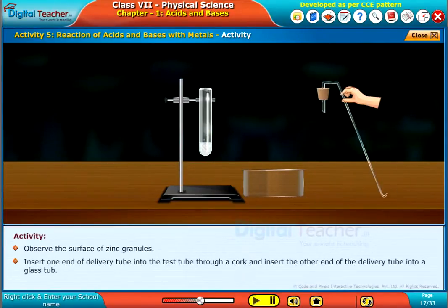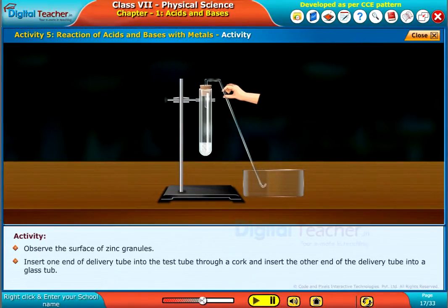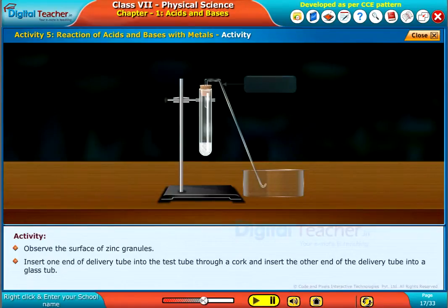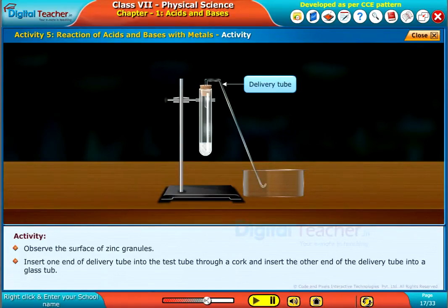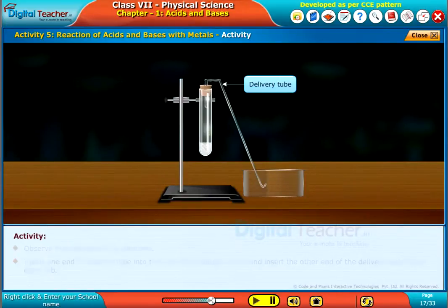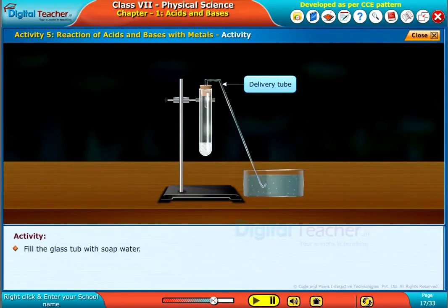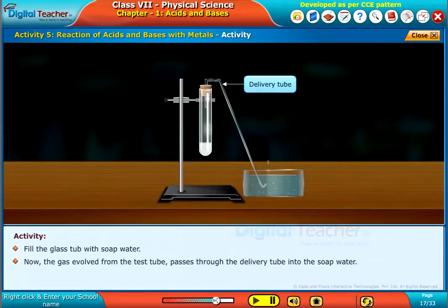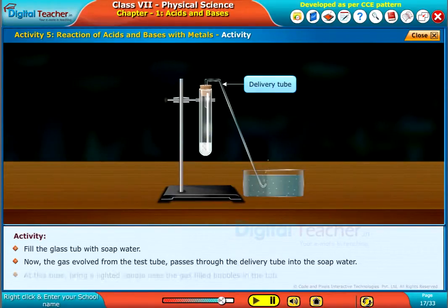Insert one end of the delivery tube into the test tube through a cork and insert the other end of the delivery tube into a glass tub. Fill the glass tub with soap water. Now the gas evolved from the test tube passes through the delivery tube into the soap water.